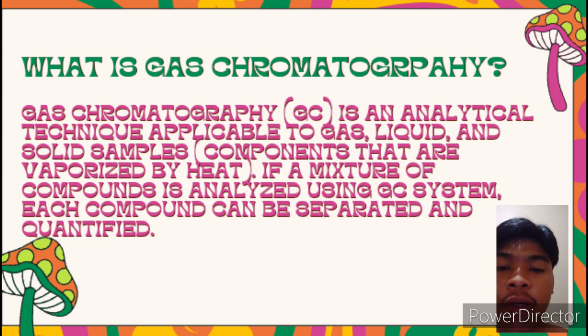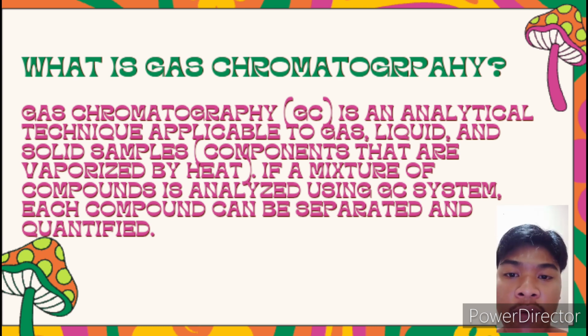Gas chromatography po is an analytical technique applicable to gas, liquid, and solid samples. Example ay mga components that are vaporized by heat. So, anything po siya na maaaring ma-vaporize like water po, yung mga ganyan po. If a mixture of compounds is analyzed using gas chromatography, each compound can be separated and quantified. So, if mag-analyze po natin siya gamit ang ating GC, ma-identify po natin yung mga compound na kasama po doon.